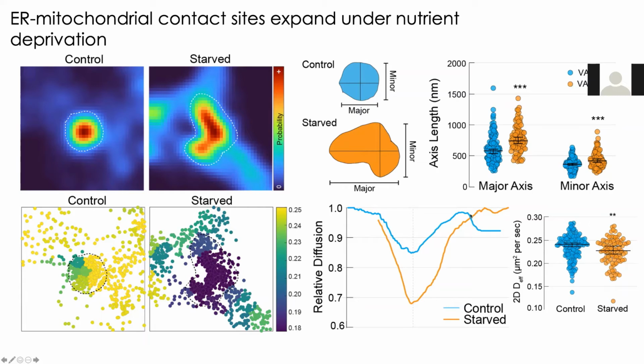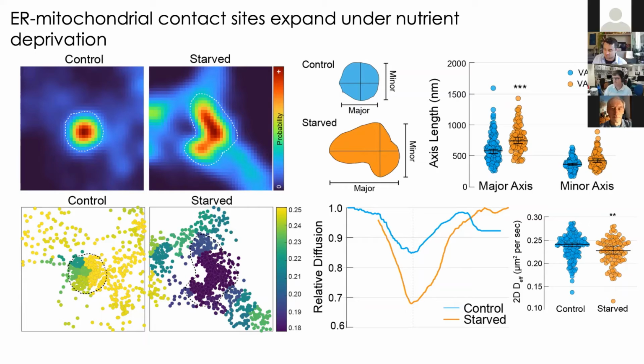So contact sites are not only expanding, they're also becoming associated with a lower diffusion coefficient.